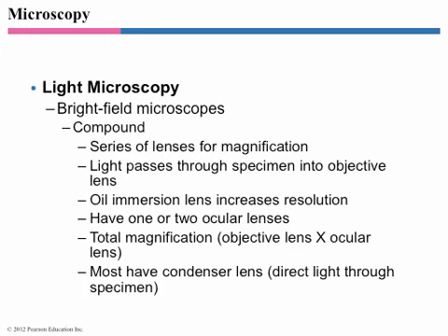Compound microscopes are what you guys are more familiar with, what almost everyone uses nowadays. They have two lenses, an objective lens which is near the sample, and an ocular lens which is near your eyes. And so the light gets magnified twice. And you multiply those two numbers together to get the total magnification. So if you're looking at 20x magnification on the objective and 10x magnification on the ocular, what's the total? 200 total, right. Many of these are going to use oil immersion to increase the resolution.